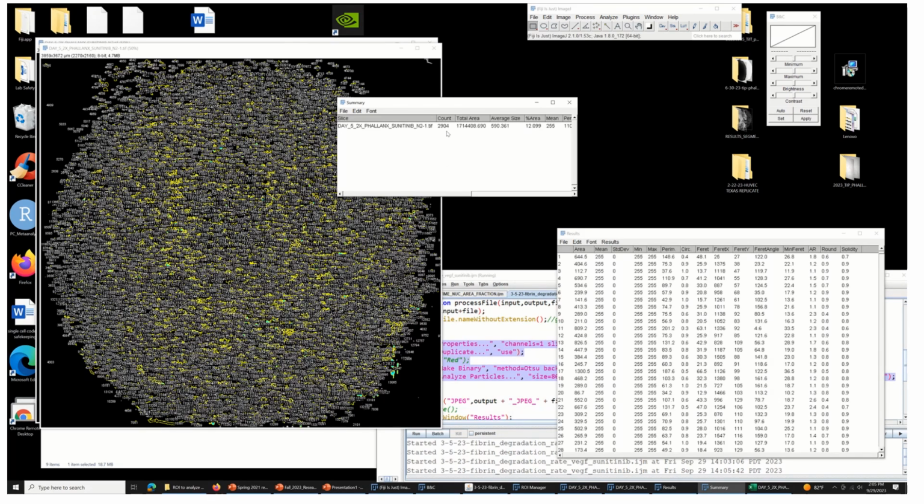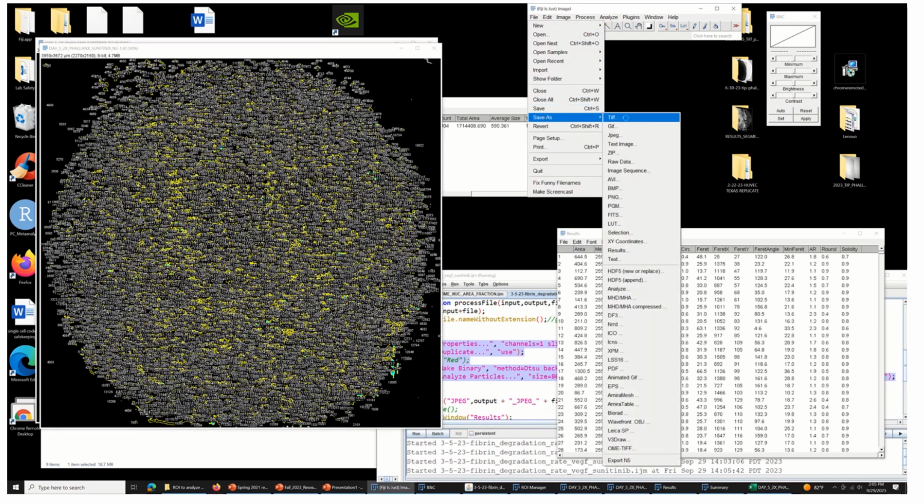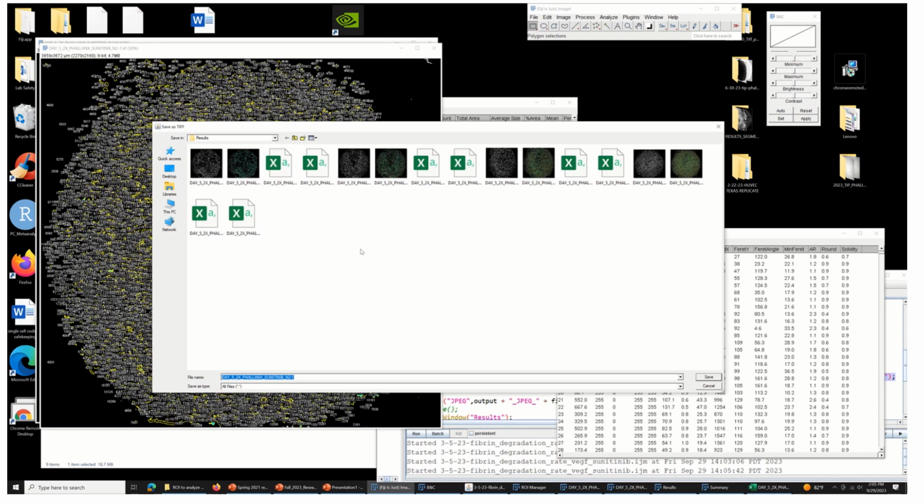Wow, so we have 2,900. There's a lot. There's just a lot going on here. So first thing I save is this guy. We'll go to File, Save As, and we'll say as a TIFF. Okay, and then it already has its name, so we don't have to type anything in.